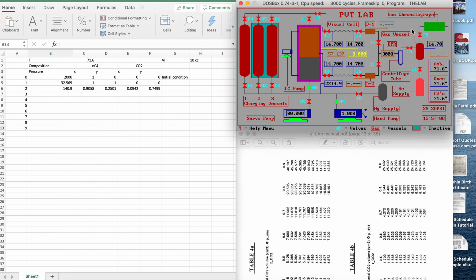So I'm gonna do another 0.5. I'm going to shake it. Okay. Still, I need to remove more, so I'm gonna do another 1. Let's see.